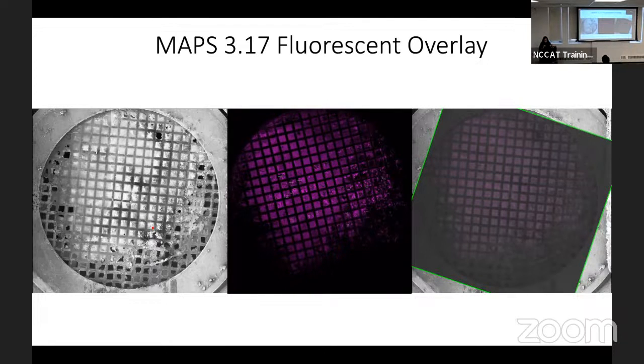Targeting cells is kind of hard because you have to figure out where it is in Z because you don't really know, and that's one of the major flaws with this. So you just mill a large lamella and hope you hit something, and then you will hit the cell, but maybe not exactly what you're looking for within the cell. But ideally, you would have a bunch of cells in your lamella, and then you'll hit it anyway.